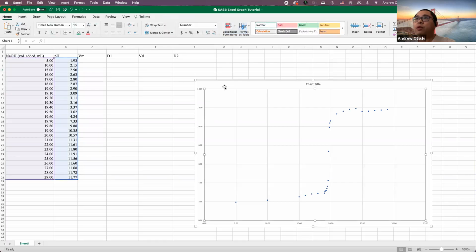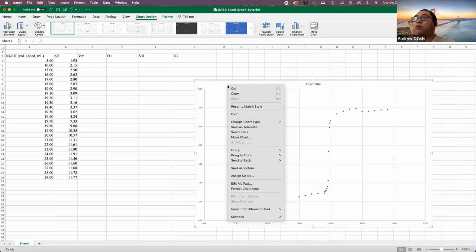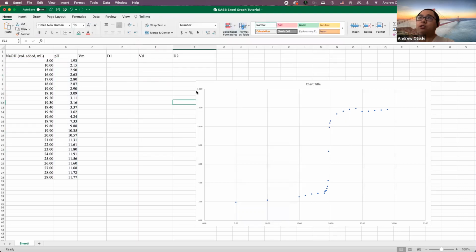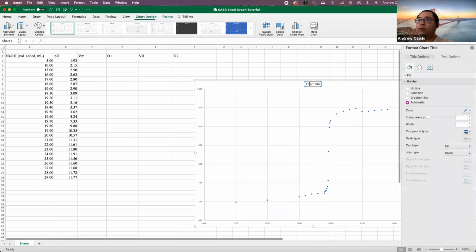Let's figure this out. Okay, so select chart. I guess you could save as picture as well, a PDF or something like that. So I think you could do that for the charts. They should be one single page, so I should have three pages of charts from each of you. You can combine them into one PDF file, but they should be one full page per chart or per graph.